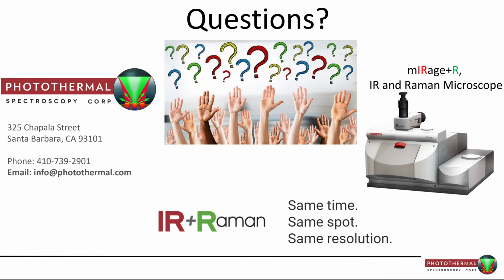We have applied it, as I was mentioning, in small objects which have a rough surface, and we could obtain very good data from that. So something more or less flat is needed, but this requirement is not as strict as in other techniques.